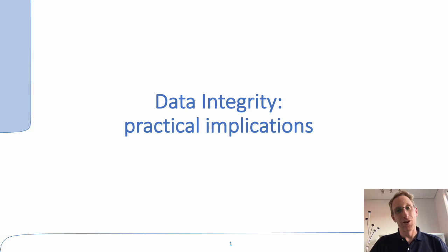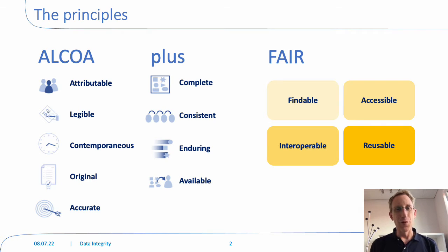Welcome back to the last topic in this series on data integrity, which aims to provide practical tips towards data integrity. In the last two topics, we talked about ALCOAplus and FAIR in a more theoretical manner. In this topic, we will talk about the procedures you could establish in your lab work to apply them.